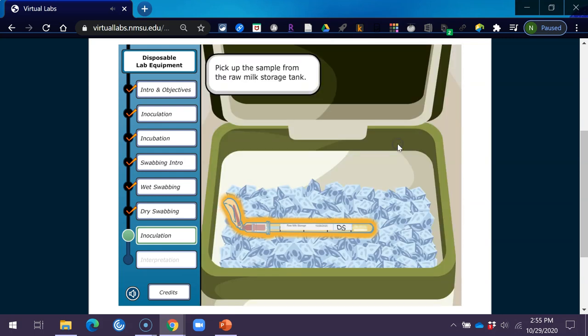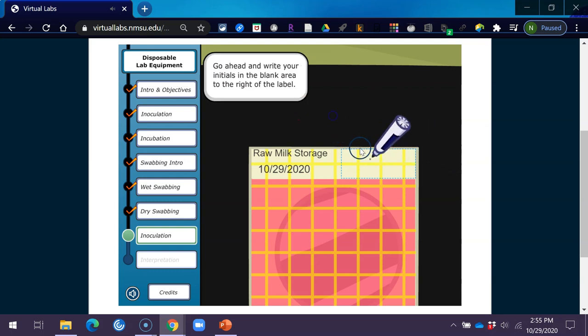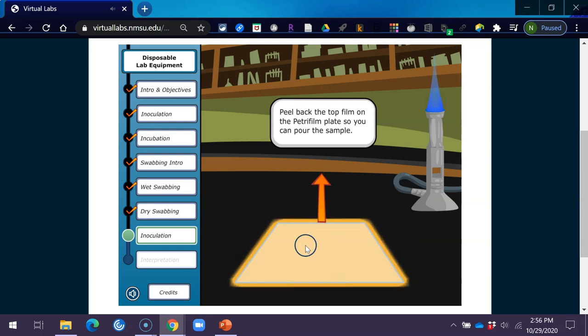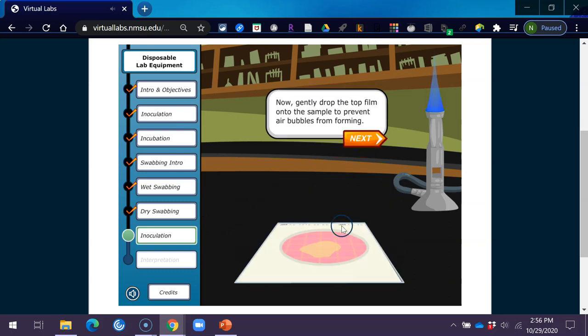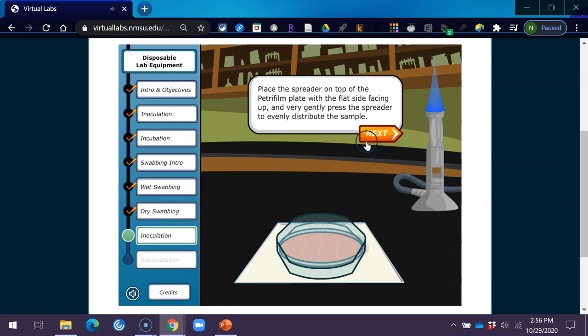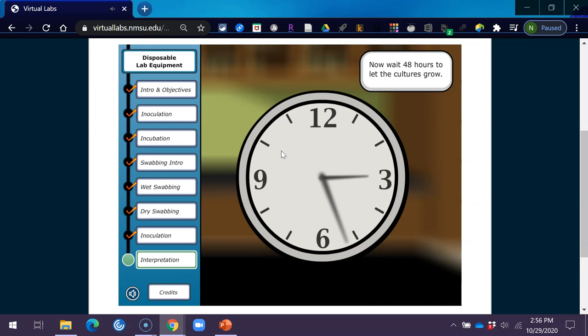Let's move on to the next sample. Pick up the sample from the raw milk storage tank. Label the backside of your second Petri film plate with the date of the sample, where the sample came from, and your initials. Peel back the top film on the Petri film plate, pour the sample, then gently drop the top film onto the sample to prevent air bubbles. Place the spreader on top with the flat side facing up and very gently press to distribute. Now your Petri film plates are ready for the incubator — set at 90 degrees Fahrenheit (32 degrees Celsius). Wait 48 hours to let the cultures grow.